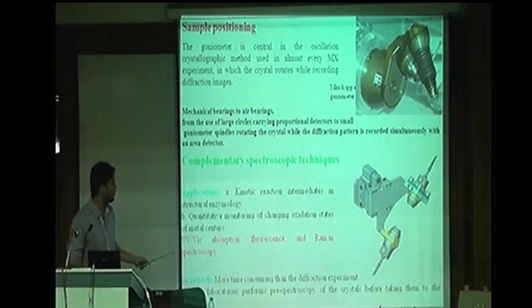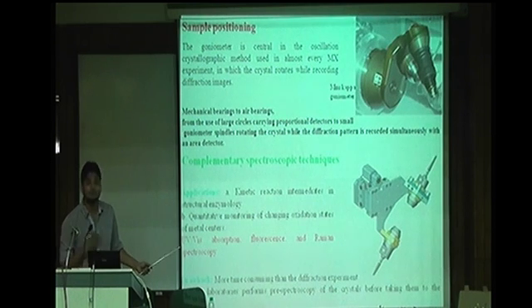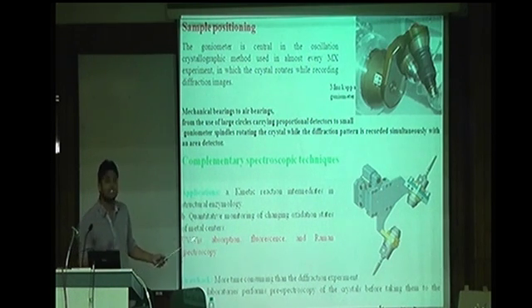And the major drawback of this spectroscopic technique is that it is even more time consuming than the diffraction experiment itself. So to overcome this, some offline laboratories perform the pre-spectroscopic studies of the crystal before taking them to the beamlines.